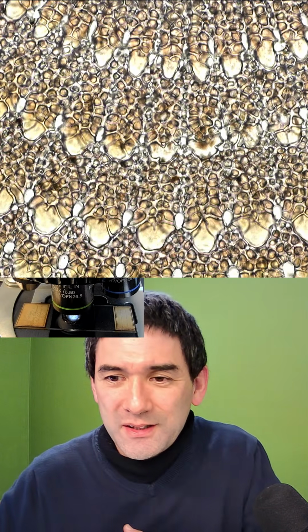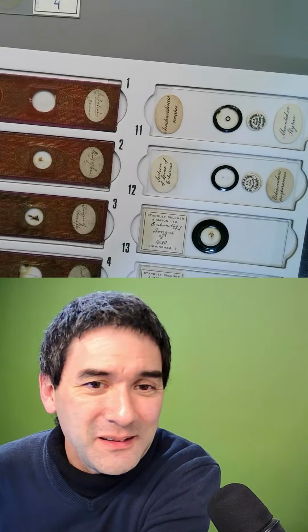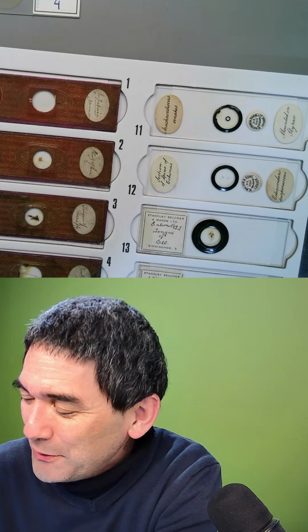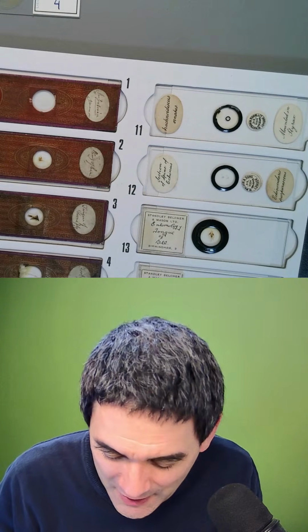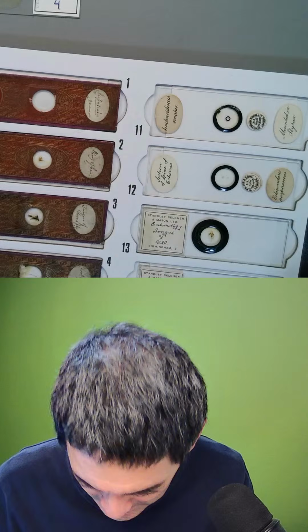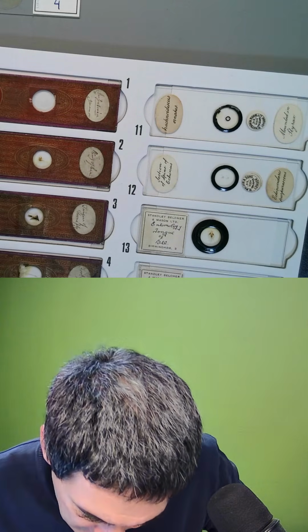So this is something that also fascinates me a little bit: that not all of the beauty and the patterns are directly encoded in DNA, but sometimes patterns emerge during the development. So I don't know what this is here. Let's have a look at it.